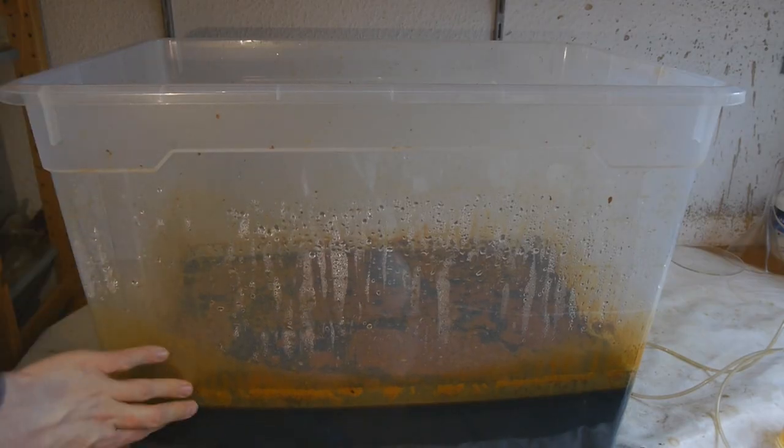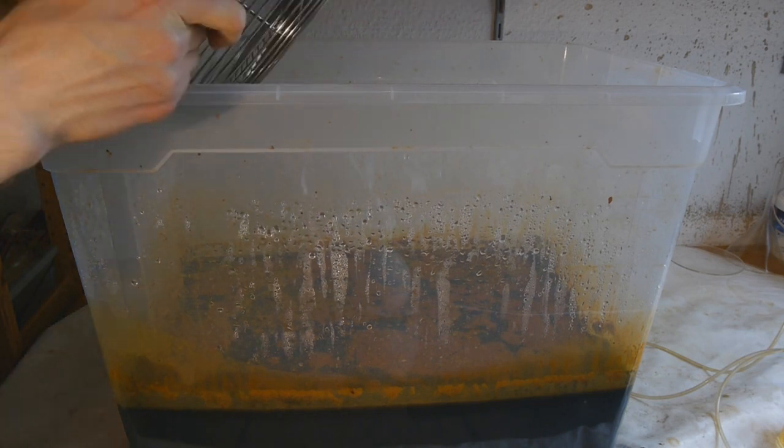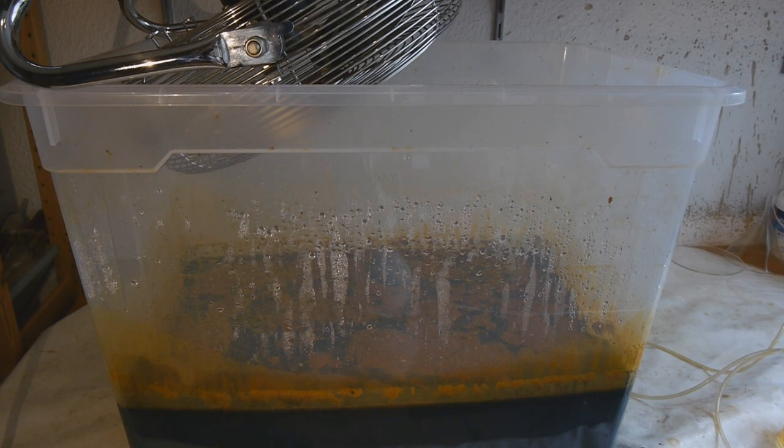So now we need to boil down all of the remaining liquid that's still inside of the iron hydroxide. Boiling this down with a hot plate would be quite difficult, and I would have to do it in several steps instead. I'm just going to put this in a warm place and place a fan up there like that. And with that I should be able to evaporate everything down in like 2 or 3 weeks.